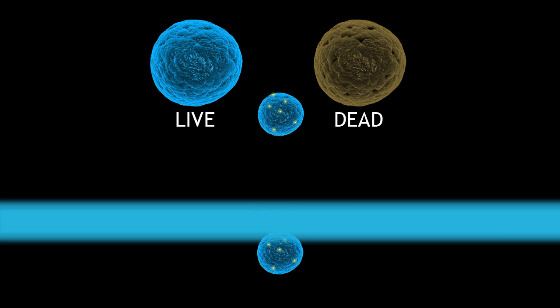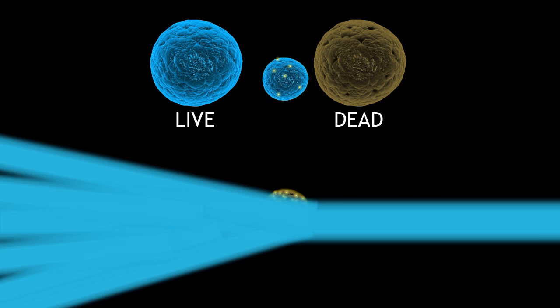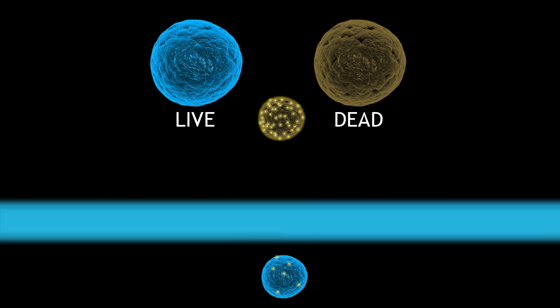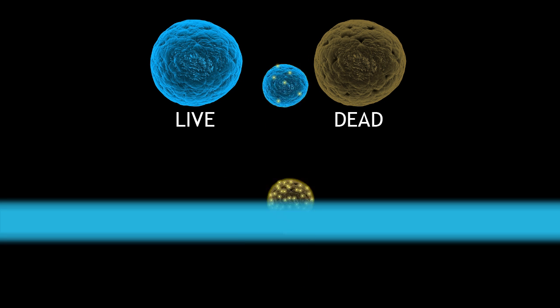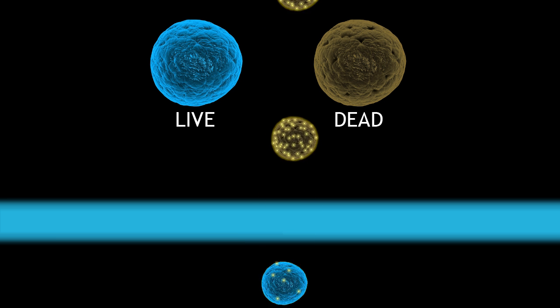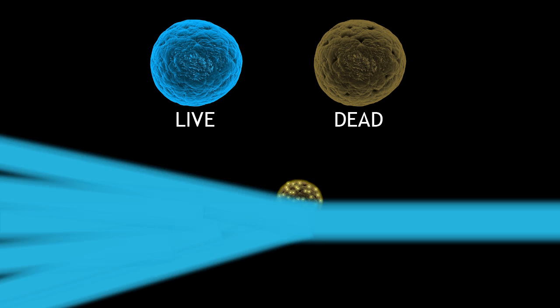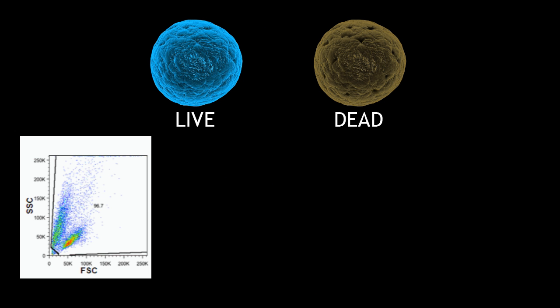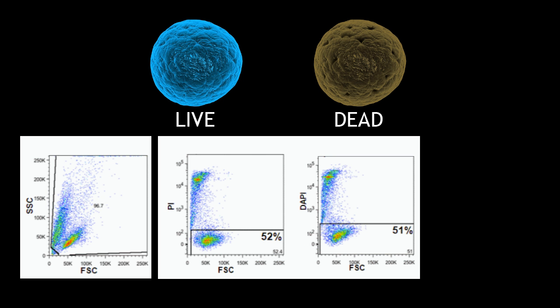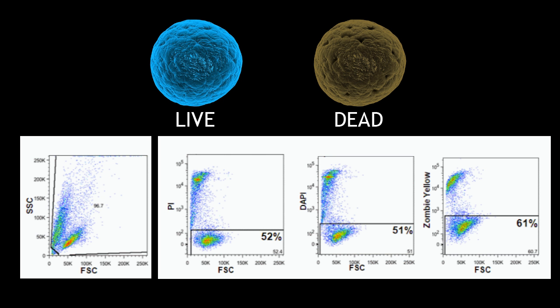You don't want to compromise your experiment by measuring artifacts in your analysis or sorting non-viable cells. Since a morphology gate alone is not sufficient to remove compromised cells, you should be including a viability dye in every experiment.